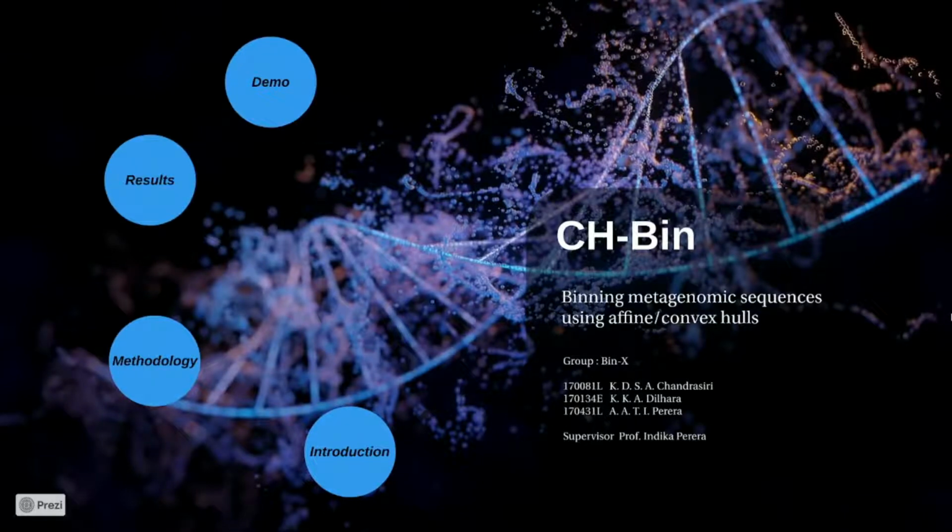CH-bin, binning metagenomic sequences using affine and convex hulls.